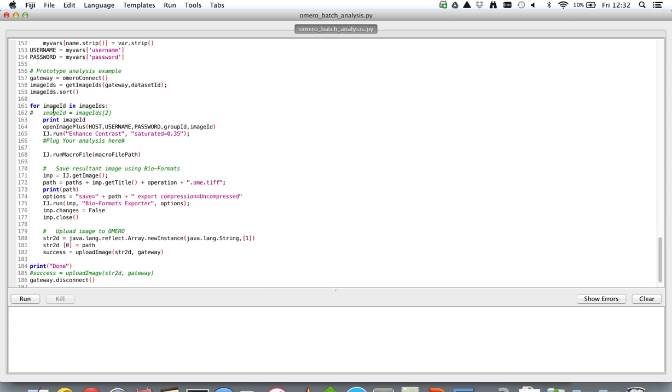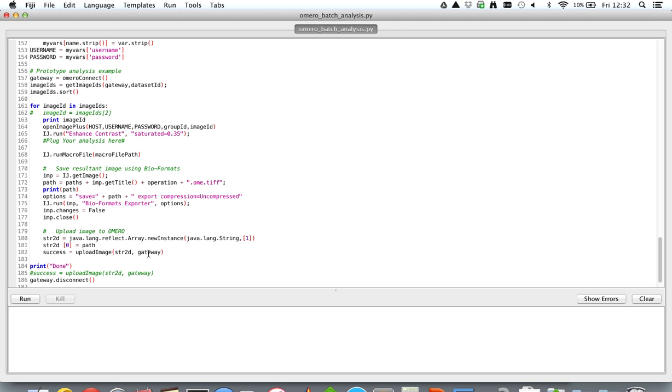Within the loop over here, images from an OMERO dataset are opened up iteratively one at a time, and then some kind of a macro which is a Fiji or an ImageJ macro is run on the image, and then the processed image is saved locally by Bio-Formats and then uploaded back into OMERO.